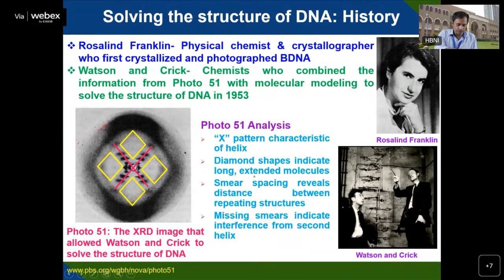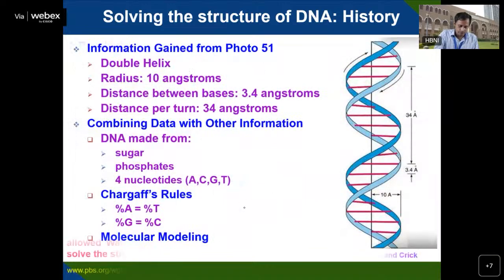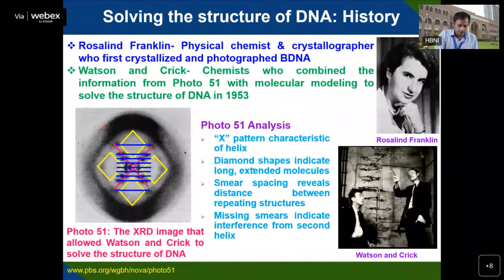Then they got the four diamond shapes. That diamond shape mainly extends, which indicates long and extended molecules are there. And in between you can see some pattern spacing.